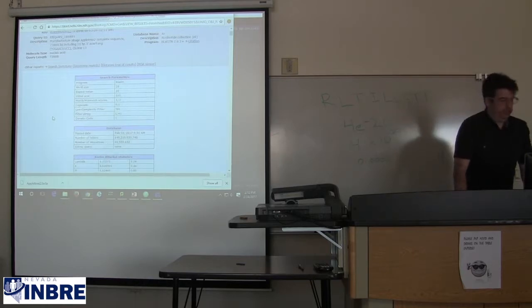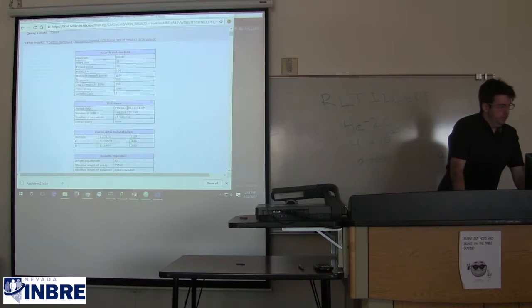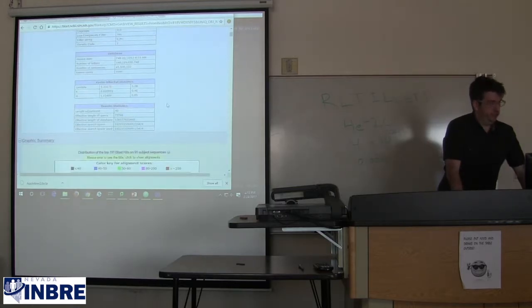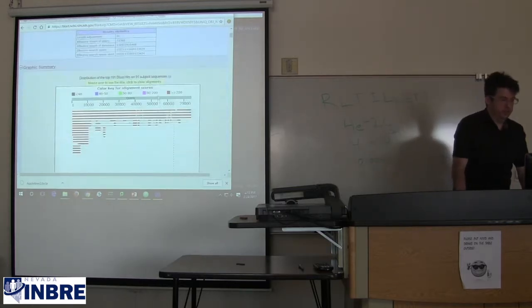This is a very large word size, 28. It won't ever show you anything with an expect value above 10 as a default. It will only show you the top 100. And in terms of those bit scores, things get 1 point for matches, -2 points for mismatches. Gaps don't cost anything. Low complexity filter, and some statistics that I'm not going to attempt to cover.